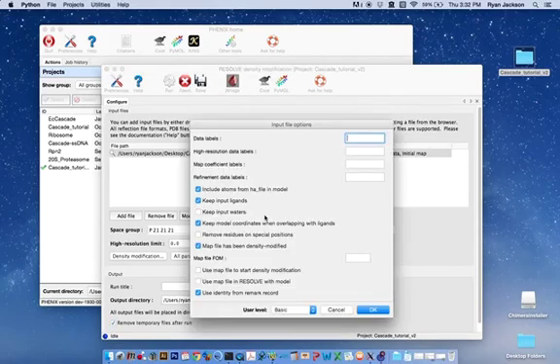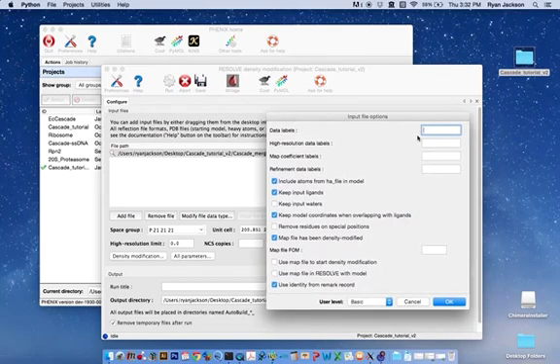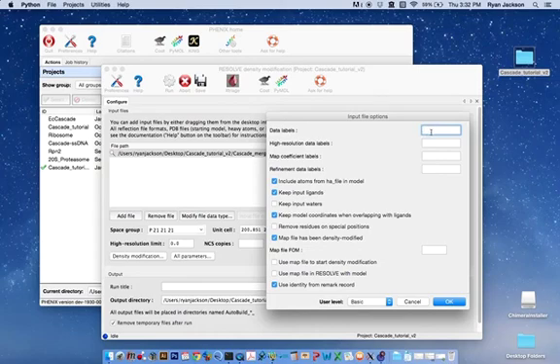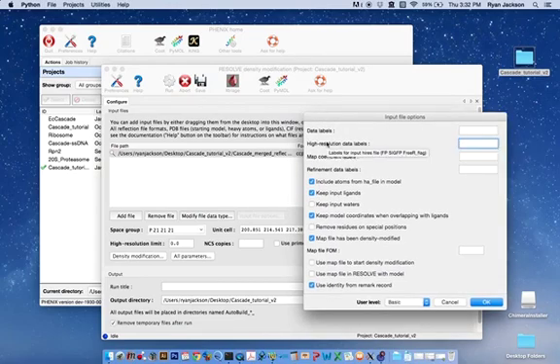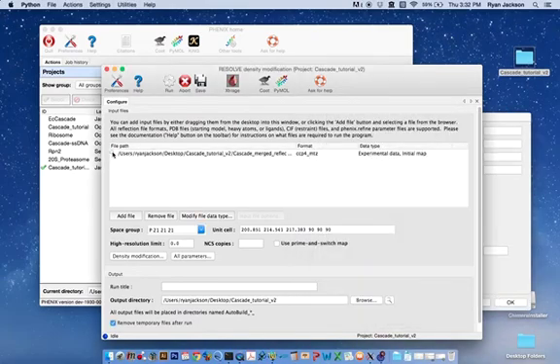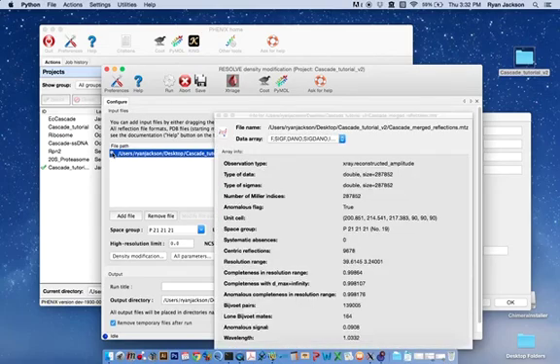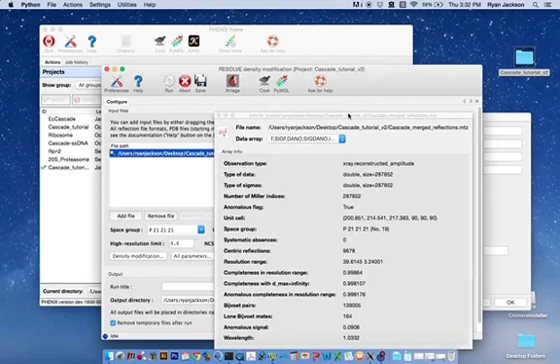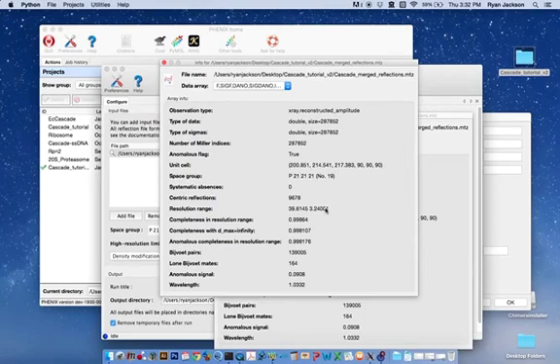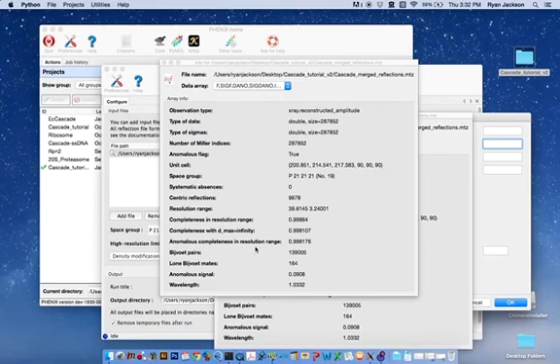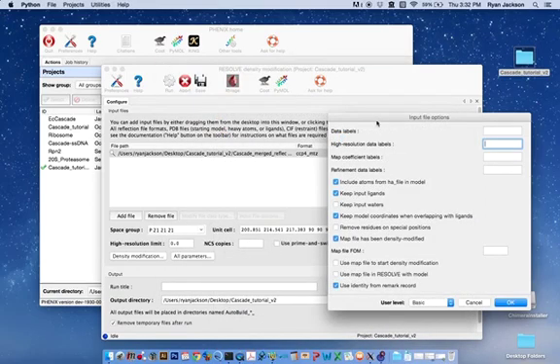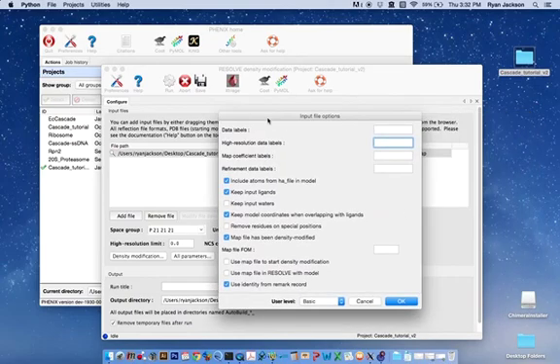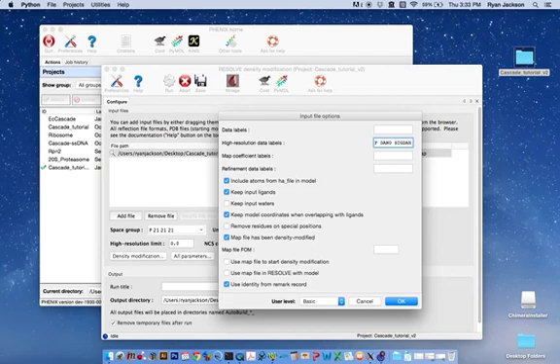The input file options. Here, we can define what arrays we want to use. Resolve does a great job of identifying these arrays automatically, but they can be included here just to make sure that it uses the right array for high-resolution. I'm going to use the array from the... Let me show you where I find that array. We can click on this tool right here. This will tell us what's in this MTZ file. This first array has data from a resolution range of 40 to 3.24 angstroms. That's what we want to use. So, this is the F, SIGF, DANO, SIGDano, and ISIM. I'm just going to close out of this and return to the input file options and type those array labels.